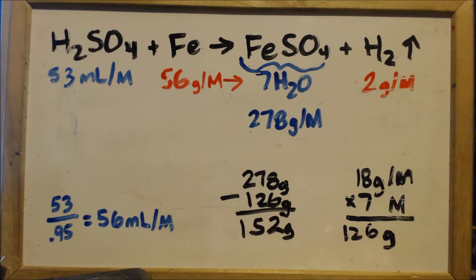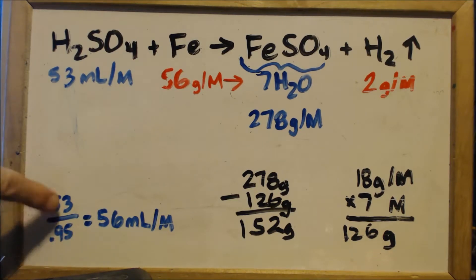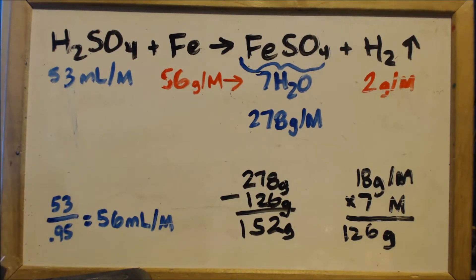And I'm just going to basically do molar amounts. I'm not going to, usually I cut it down, but this isn't that much. 53 milliliters of sulfuric acid, 56 grams of iron. And since it's 95%, which I'm guessing, I'm going to put in 56 milliliters.